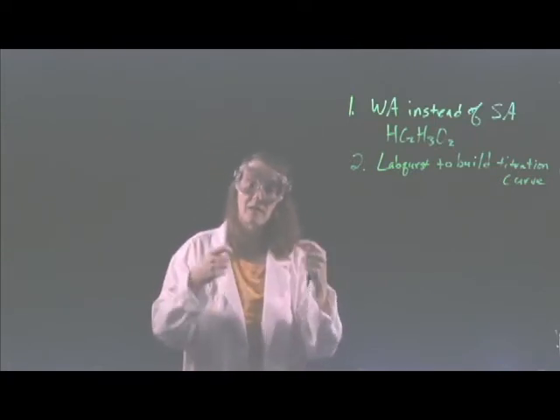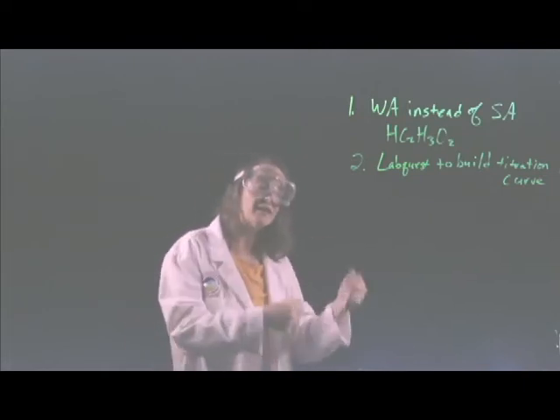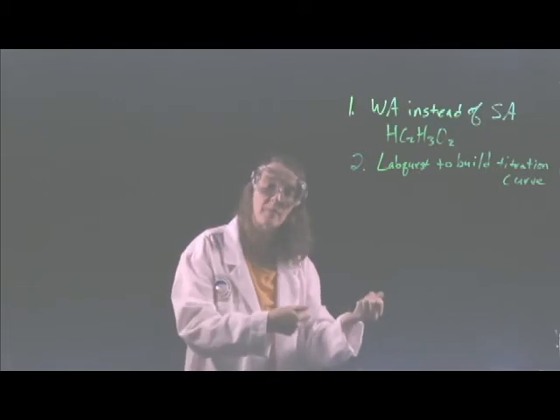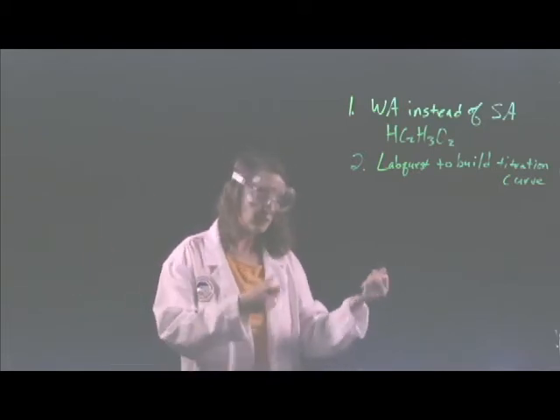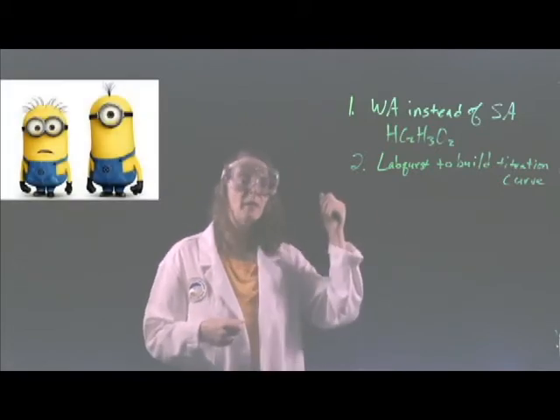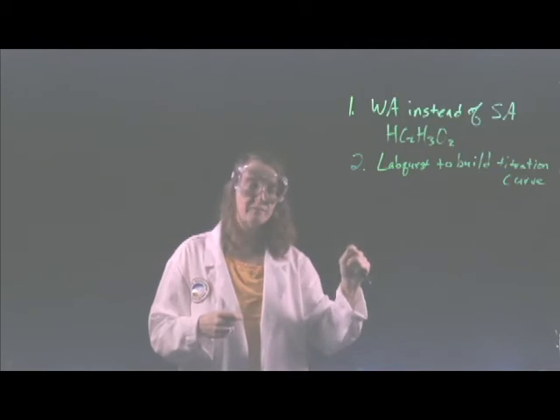See one of the assistants to make sure you get a LabQuest device with an SD card. Because if you run the experiment without pulling up the right file, you can wind up having to redo the experiment because it does something entirely different. So we don't want that to happen. Make sure you get the experiment off the SD card.